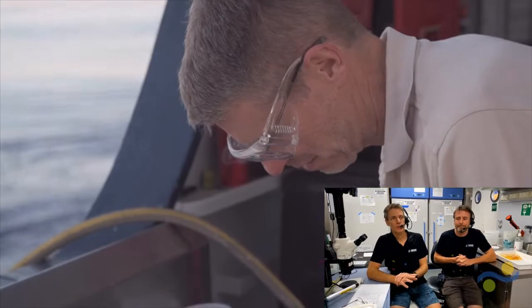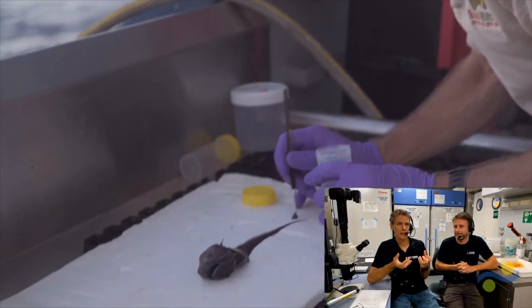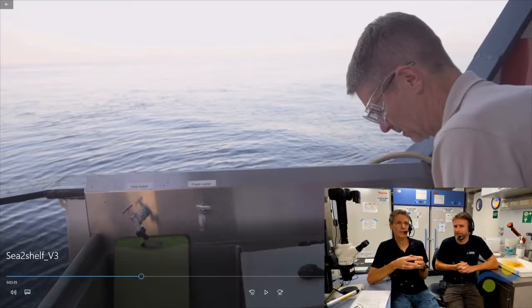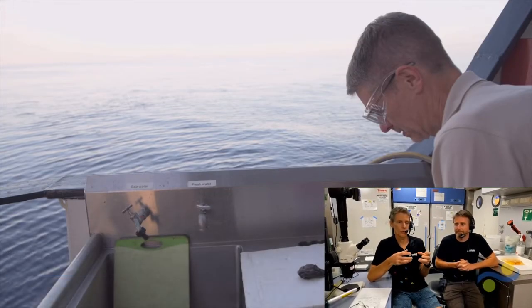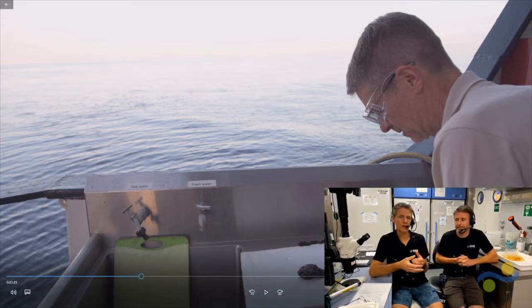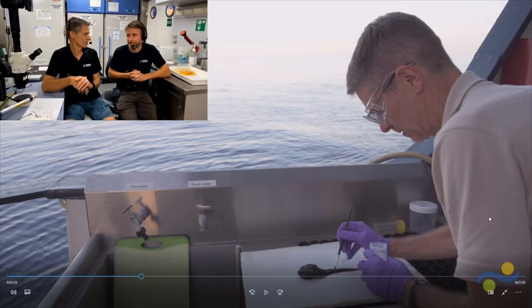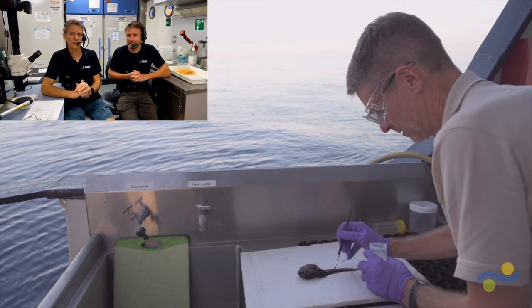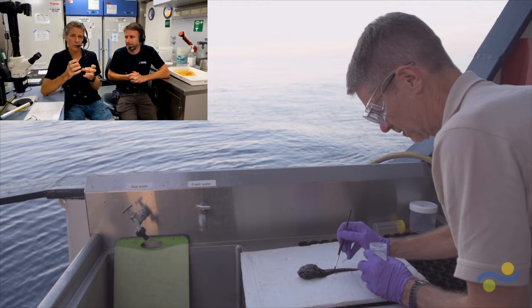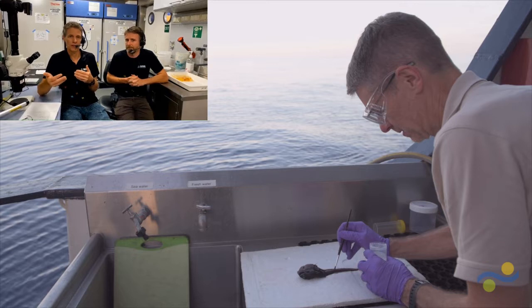The photography that we're doing at this point is really critical, because this is the closest thing that we can get to do close-ups and things like that of a very fresh specimen. We have these incredible 4K cameras on the ROV, which is the first opportunity we've really ever had to get in situ photos of such high quality. To get them up on the deck, I can zoom in onto certain parts of the anatomy that I know are important for future identifications.